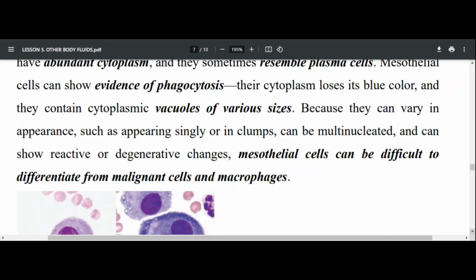In fact, macrophages can be seen in various conditions. For example, in inflammatory conditions, macrophages are present, and also in many non-bacterial infections or inflammatory processes, for example, tuberculosis, also neoplastic transformations, and other inflammatory conditions associated with these cavities. In bacterial infections, the neutrophils are always responsible at first, and then macrophages will also be present.